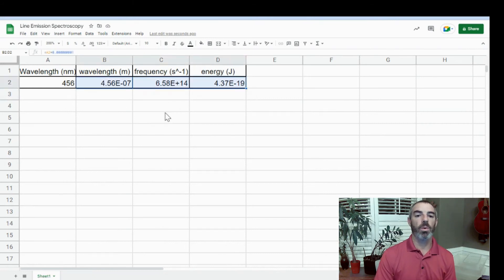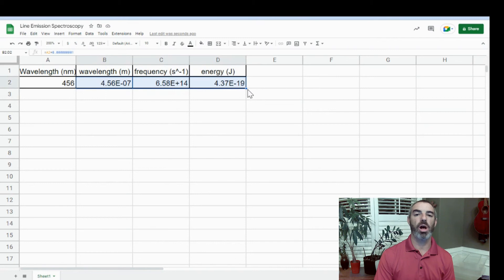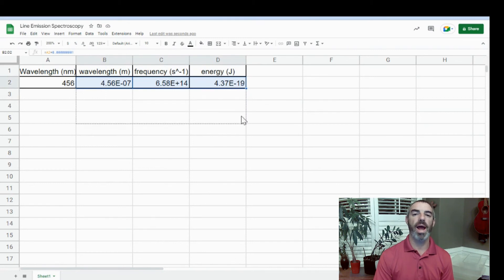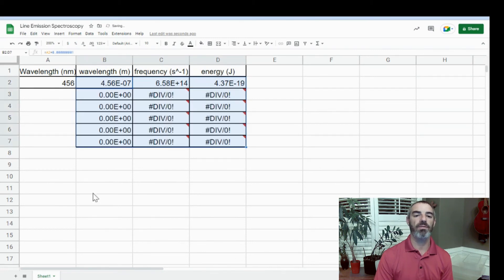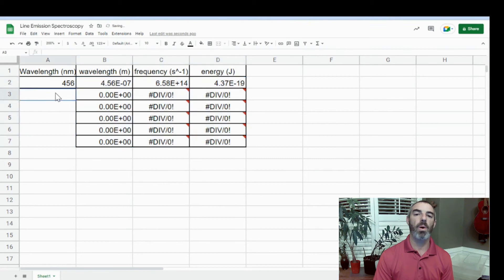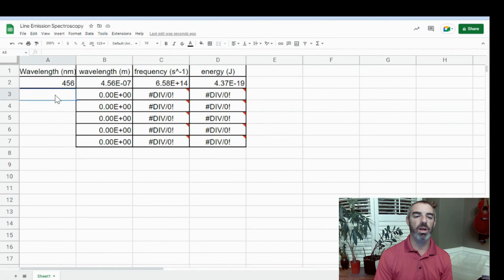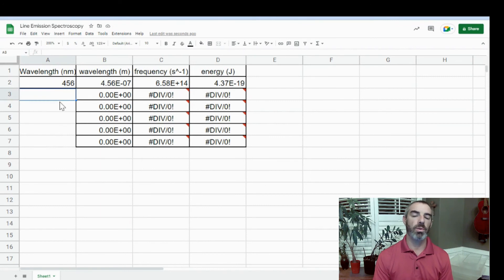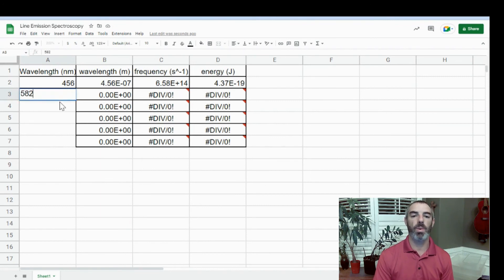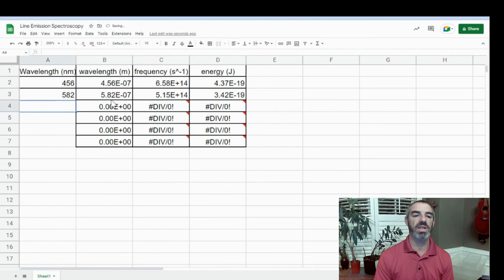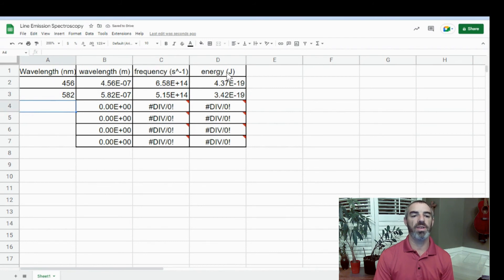Now we're going to highlight the three boxes and have this black cross appear in the bottom right corner and drag down as many data points as we have. Now we can just type in data points into our wavelength column in nanometers, and it will do all the conversions for us. So let's say we have a 582 wavelength, and you can see we have all of the data calculated for us.